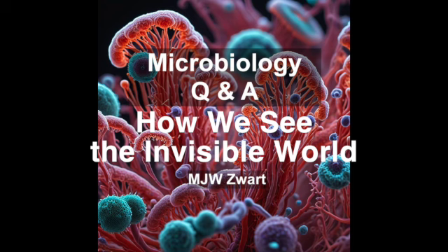Exactly. But what about living cells? I remember having to stain them with dyes to see anything. Staining is certainly one approach, but it can alter or even kill the cells you're trying to observe. That's not good. Not ideal. Luckily, we have techniques like phase contrast microscopy, which takes advantage of the fact that light travels at different speeds through different parts of a cell. Yes. This creates subtle differences in the way light waves interfere with each other, resulting in contrast in the image. So you can actually see the internal structures of a living cell without killing it.